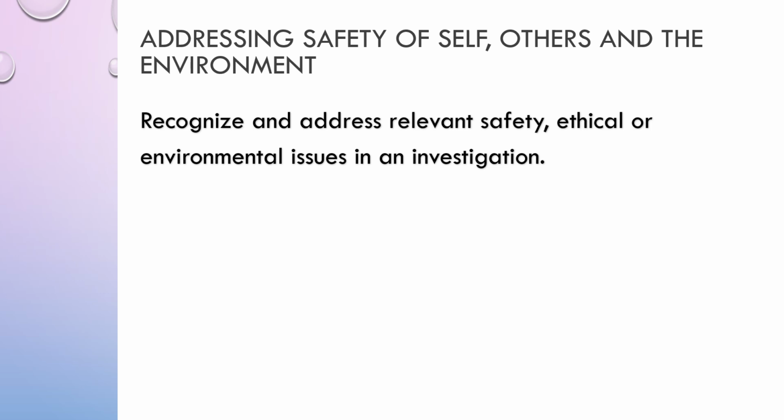I don't want this to take the place of any of your safety guidelines that are at your particular school site, which could be very different depending on your location. But some very general things that do pop up in actual questions has to do with safety things like heat. So hot glass looks the same as cool glass. Make sure that if you are heating anything, you are using appropriate safety tools to protect from the heat. We have like the red rubber hot hands. You could be using tongs or other tools that can protect yourself from burns.